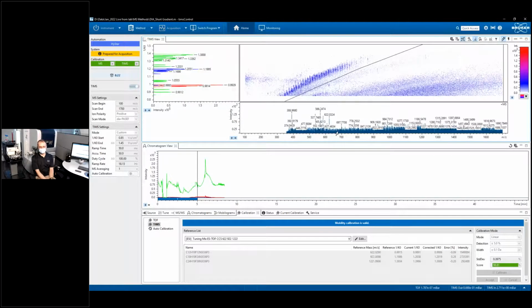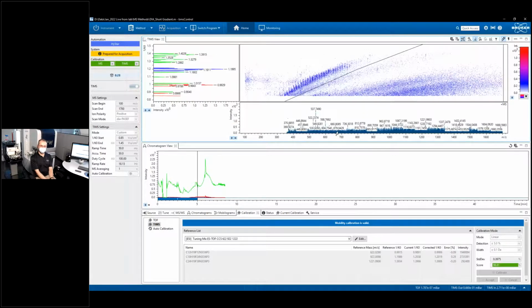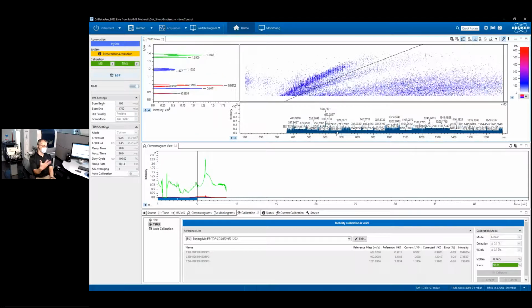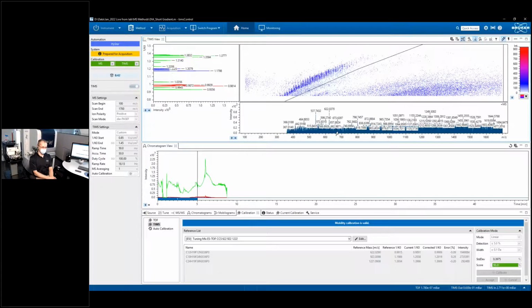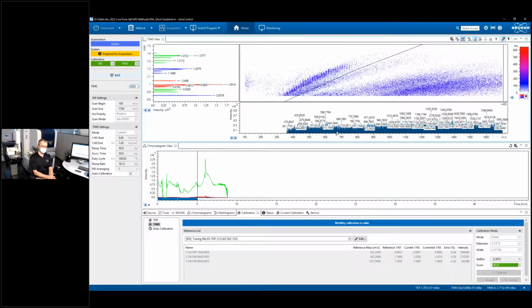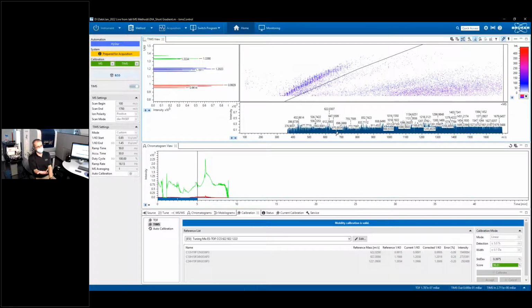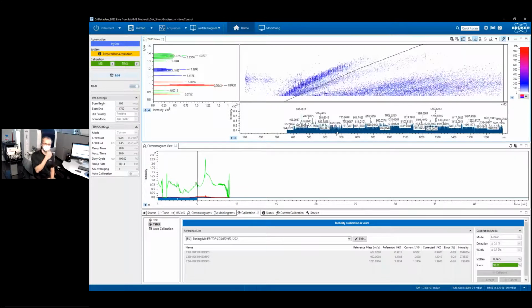And so yes, it's based on that search technology, but by using graphics card processing, we're able to really speed up the database search, such that, as we mentioned, it's literally searching each spectrum on the fly. Even when we're acquiring data at over 100 MSMS per second, because of the high number of cores in the graphics cards, we're able to keep up with that data acquisition rate and search all those MSMS spectra in real time, such that once the acquisition is completed, your database search is complete as well. So no having to move the data to a search engine and wait for it to process the data. You get that database search result straight away.